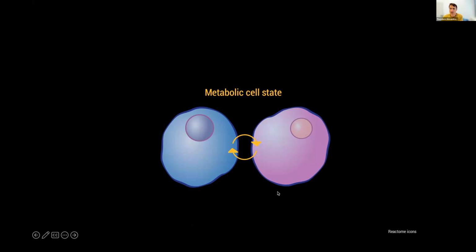It's about metabolic cell state. Definitely in imaging, but also in single cell analysis, such as single cell RNA-seq or transcriptomics, we now know that our bodies consist of a multitude of cell types, where cells differentiate into different cell types. But what's even more interesting is what happens with the cells post differentiation. One cell type can have multiple functions, and these functions are tightly linked with which small molecules or metabolites are inside the cells, and metabolic programs.